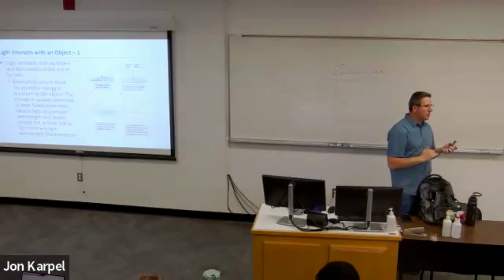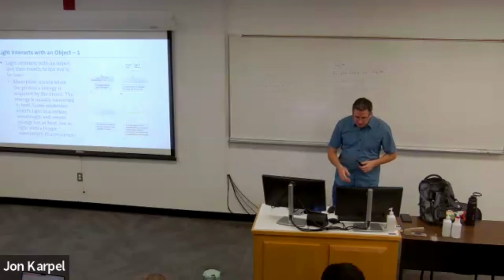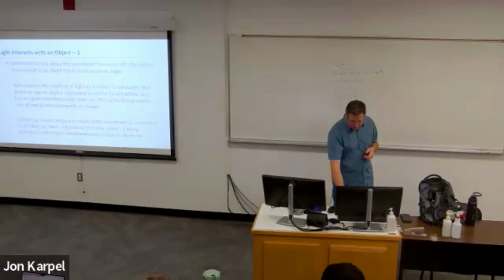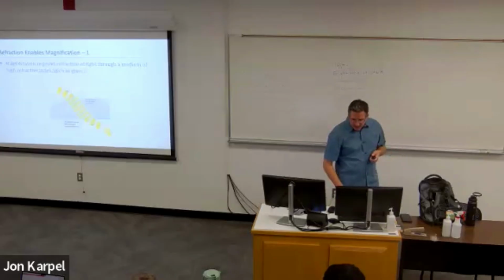It actually changes direction. So we have to correct for that when we use some of the microscopes in the lab. So it kind of just shows you what's going on with those. I'm not going to test you on the difference between reflection and refraction and all that, okay? So you can kind of just breeze through this and try to get an idea of it.